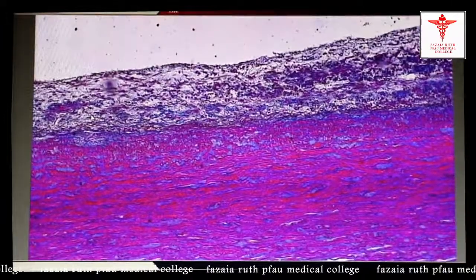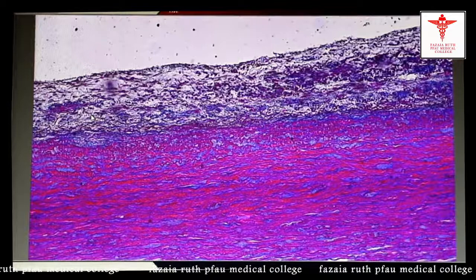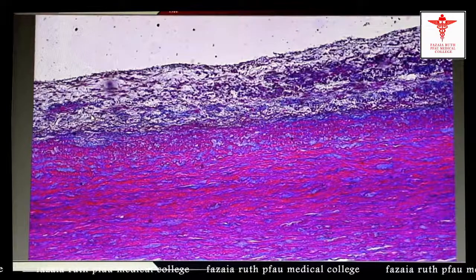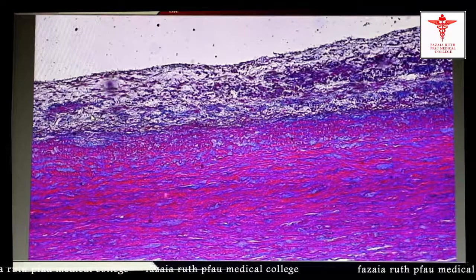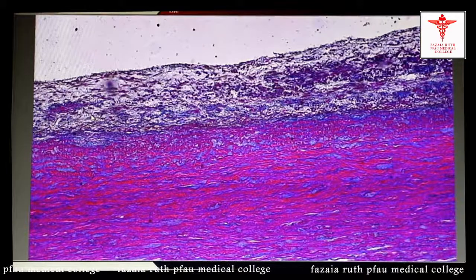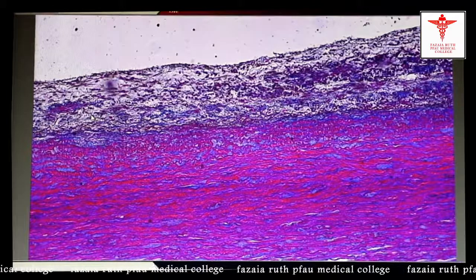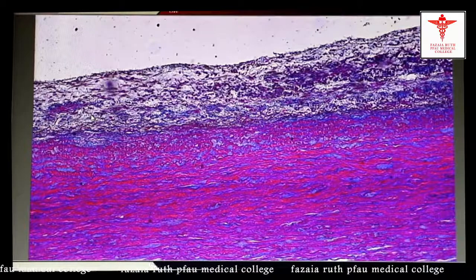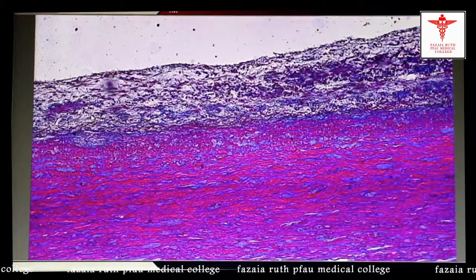Here is a magnified picture of the elastic artery. Focusing on the tunica media, we can see it is richly filled with elastic fibers, and we cannot appreciate the internal elastic lamina separating the tunica intima from the media. Moving further to the exterior, we also cannot appreciate the external elastic lamina. These are the identifying features of the elastic artery: no internal elastic lamina, abundant elastic fibers in the tunica media, and no appreciable external elastic lamina.